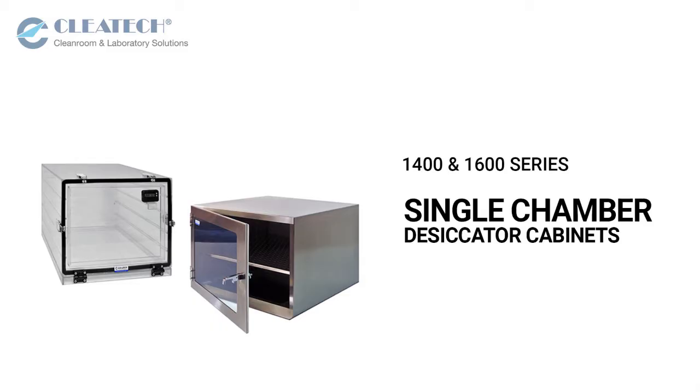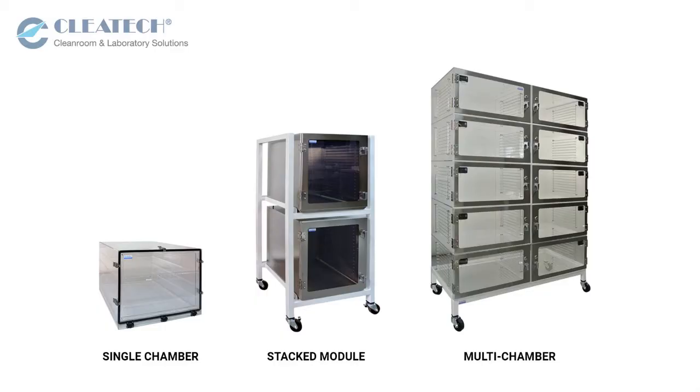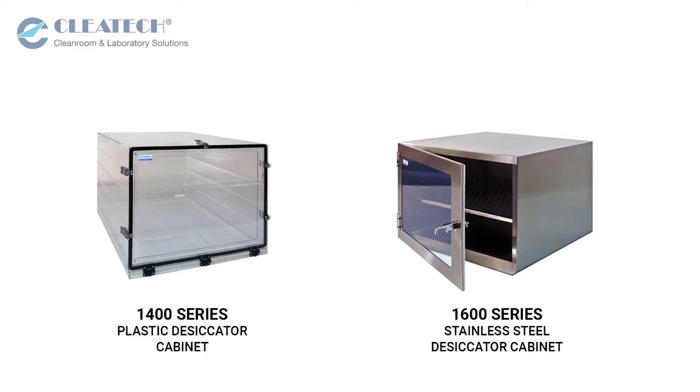Clitec desiccator cabinets are available in a single chamber, stacked modules, or multi-chamber configuration. In this video, we will be showcasing Clitec's 1400 and 1600 series single chamber desiccator cabinets.